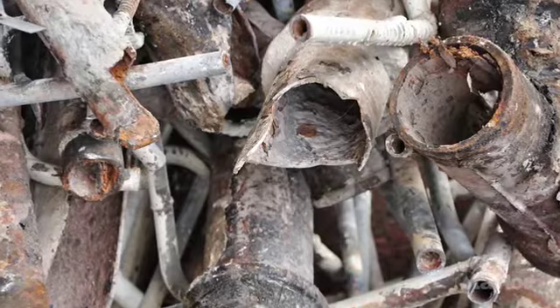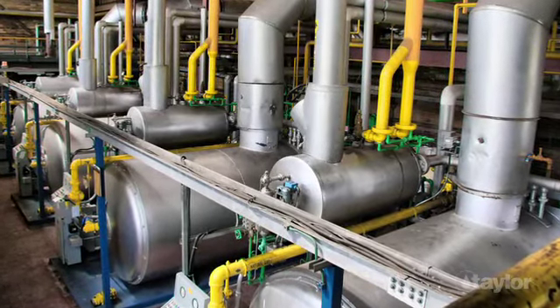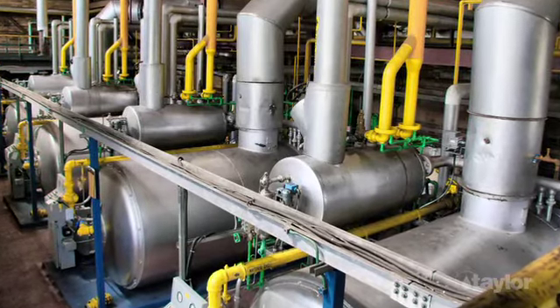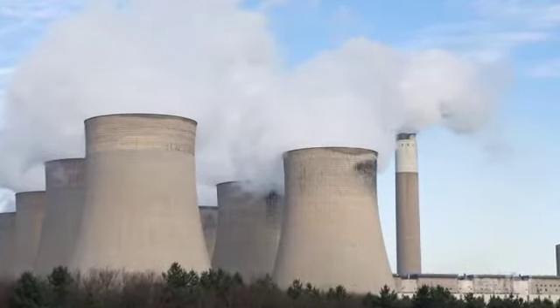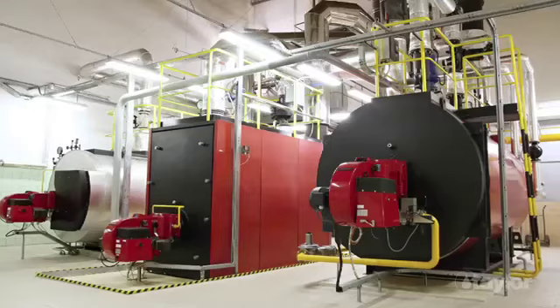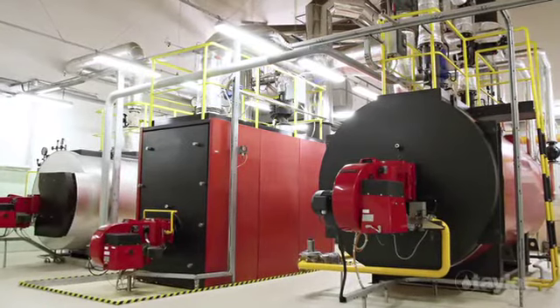Chloride is mainly tested to control blowdown in boilers and bleed off in cooling systems. Determining chloride levels is also helpful in characterizing boiler feed water and detecting leaks in boiler system condensers.